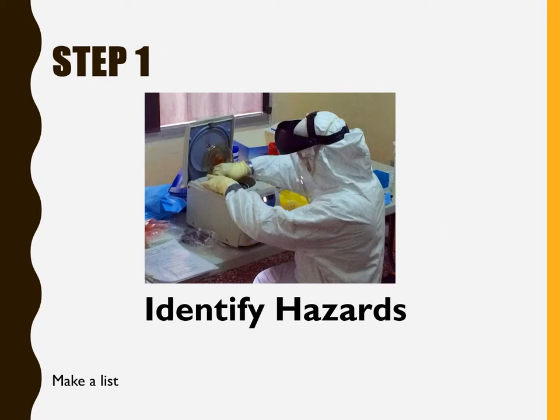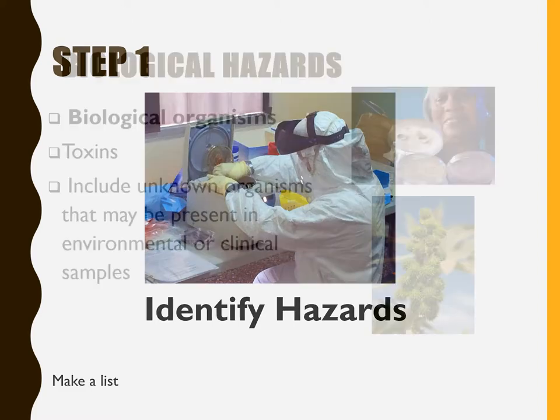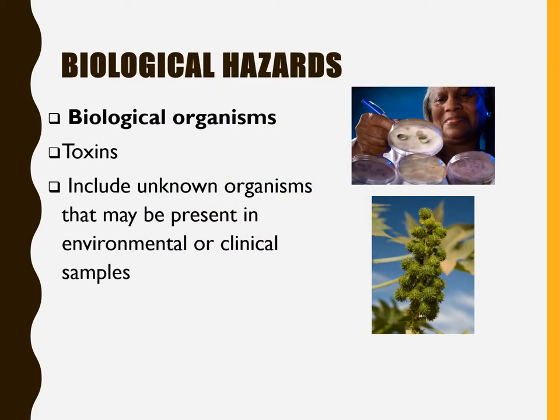Step 1: Identify the hazards and make a list. Examples of hazards would be biological hazards like pathogenic organisms, toxins, and unknown organisms that may be present in the environment or clinical samples.